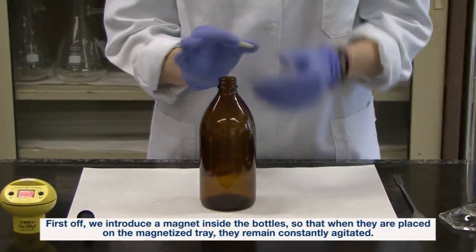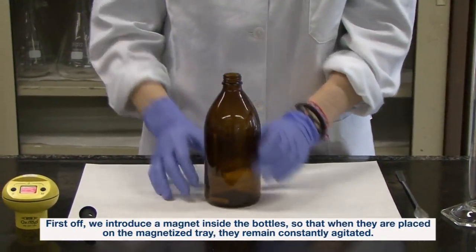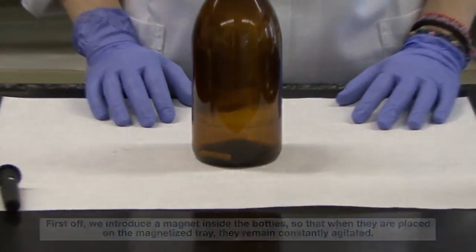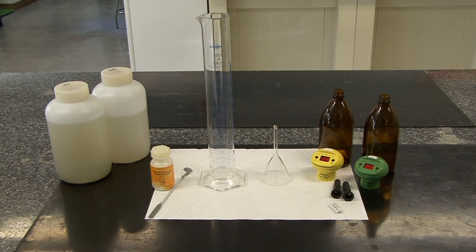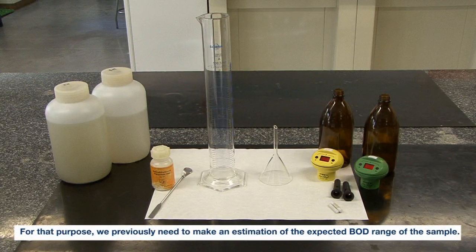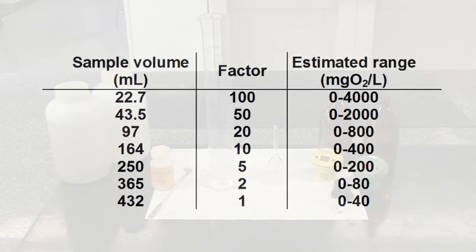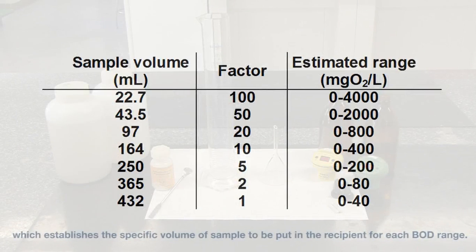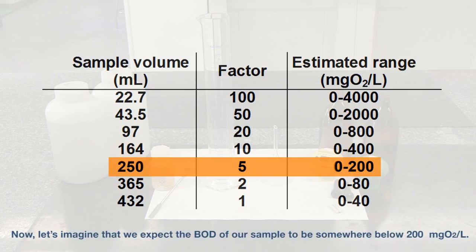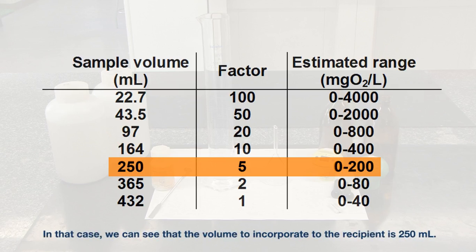First off, we introduce a magnet inside the bottles so that when they are placed on the magnetized tray, they remain constantly agitated. Now we need to determine the volume of sample which will be introduced in the recipients. For that purpose, we previously need to make an estimation of the expected BOD range of the sample. With that information, we go to the table provided by the device manufacturer, which establishes the specific volume of sample to be put in the recipient for each BOD range. Let's imagine that we expect the BOD of our sample to be somewhere below 200 milligrams of oxygen per liter. In that case, the volume to incorporate to the recipient is 250 milliliters.